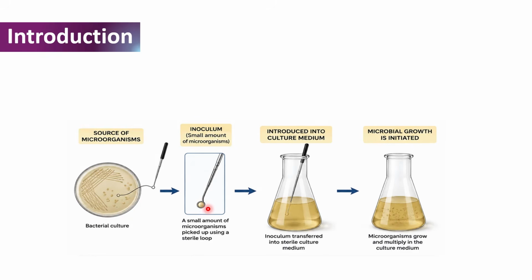The second picture shows a small amount of the bacteria culture picked with a sterile inoculation loop to inoculate a new sterile culture medium to cause microbial growth.